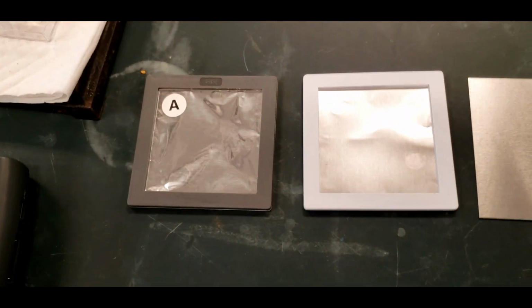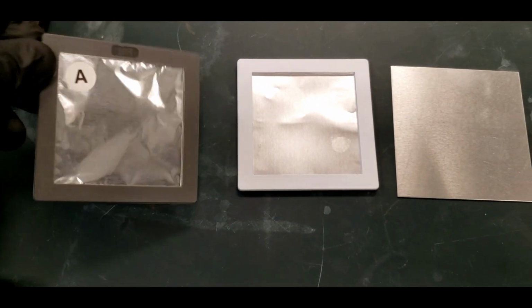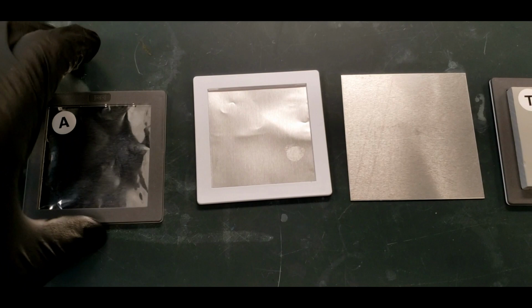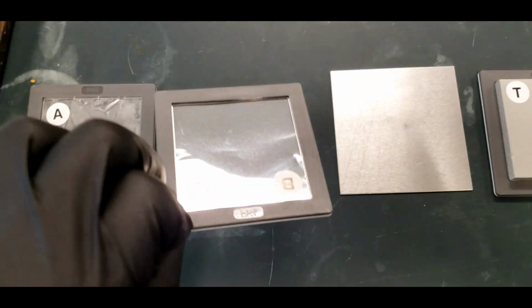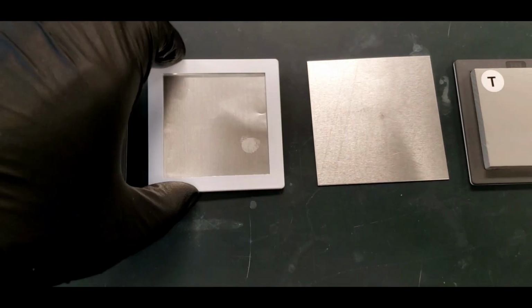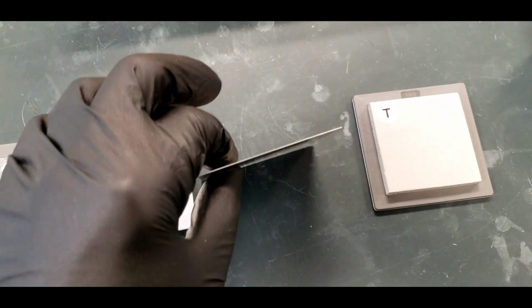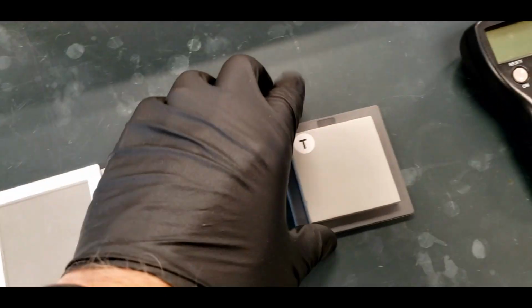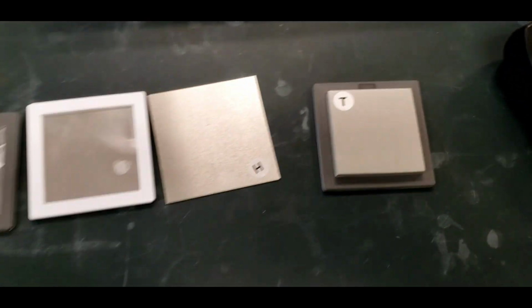Over here is just thin aluminum foil. These are absorbers. We're going to put these over the samples to see how they absorb the different kinds of radiation. And then this is a thicker version of the thin metal, and this is actually a fairly thick piece of aluminum. And then here is lead, very thick, heavy.